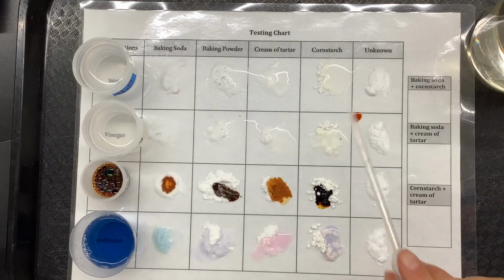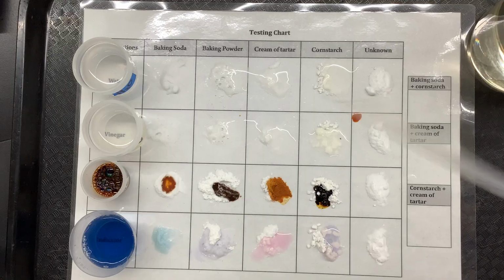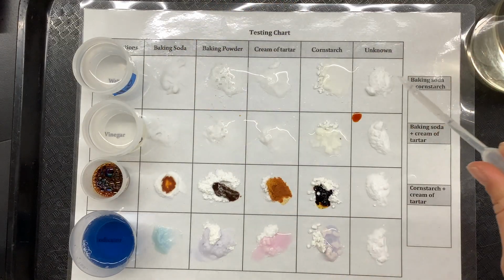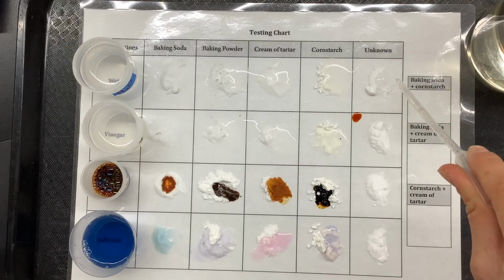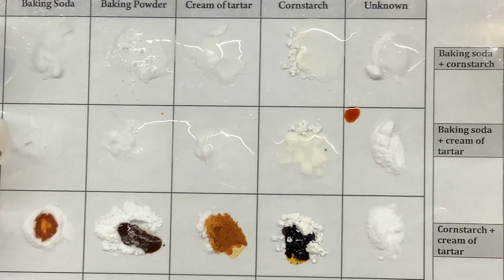Okay, now we're on to our unknown powder. We're trying to figure out which one of these is our unknown. Here we go. Water and the unknown. What's happening there? Looks like, I don't know if you can see.